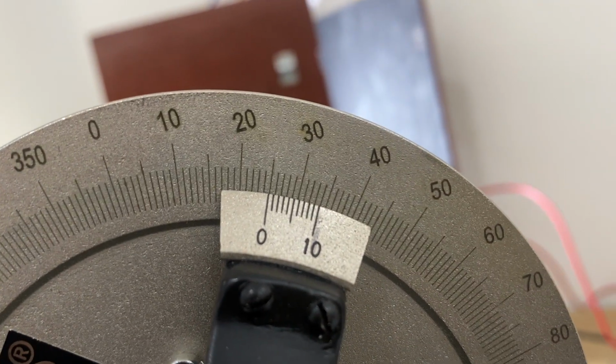So now I start moving the scale to the other side, and see that this is becoming slowly dark. Half part is dark. See this. Now it is completely dark. Now move more. Full dark is there. You cannot observe anything on the other side. Now slowly I am moving it again to the whiter side. See, this has become pure white. Right. This is the reading for 25 point something.